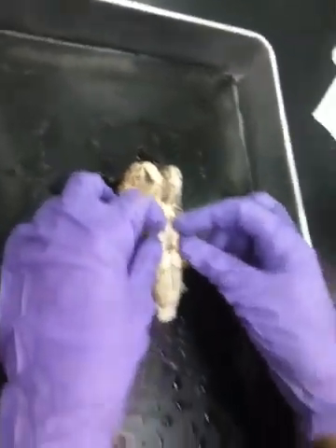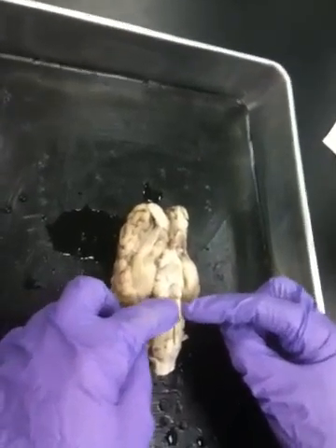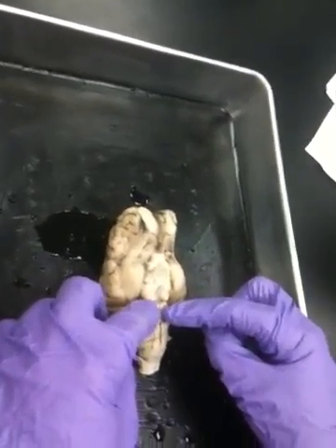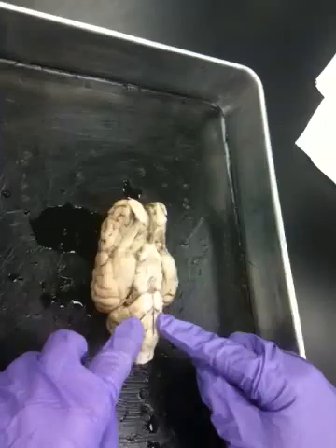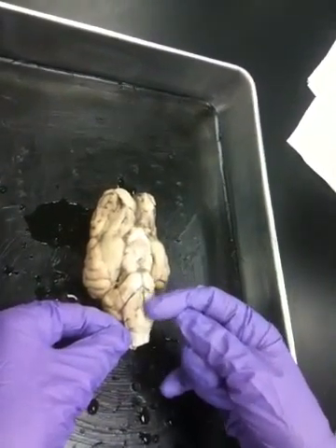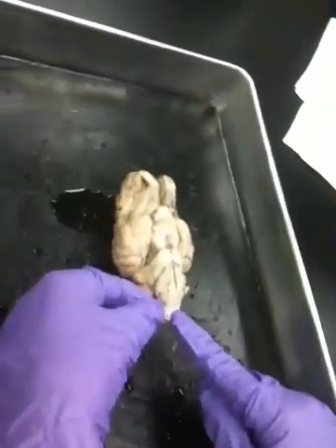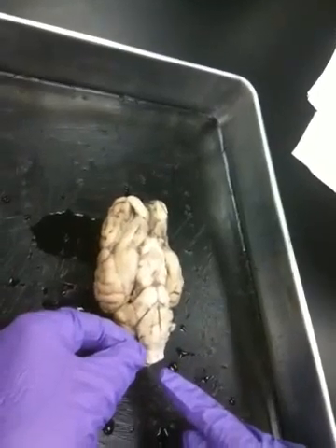Okay. So this portion in here is midbrain, and then this is the pons. Oh, never mind. Mine looks flat. Okay. And then the medulla oblongata. Medulla oblongata is here, and you can see that it suddenly goes from looking like this kind of tissue to very white. That's because this down here is now spinal cord. Yeah, so it looks different.